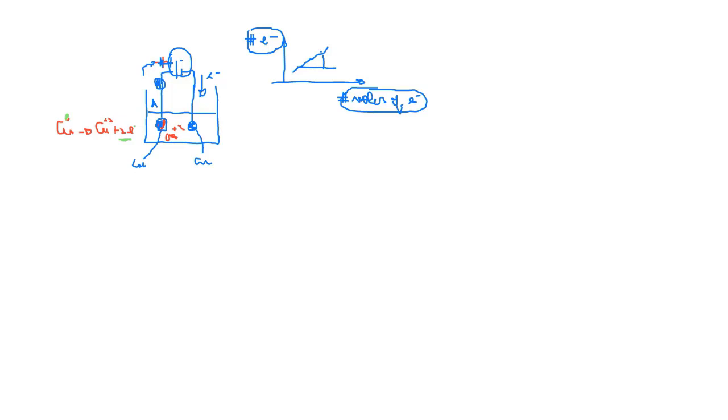Does it make sense? If we know the mass of copper that is lost, we convert it into moles of copper using the atomic weight. And then, because of the molar ratio, 1 mole of copper releases 2 moles of electrons, we just multiply by 2. So we are going to obtain the number of moles of electrons that way, using the weight loss of the copper.